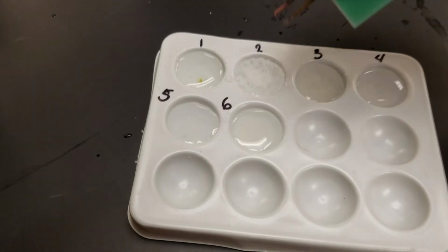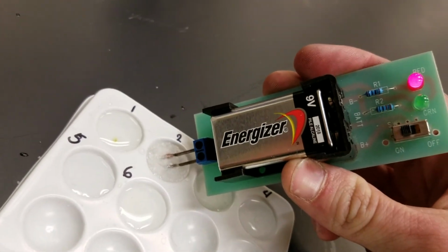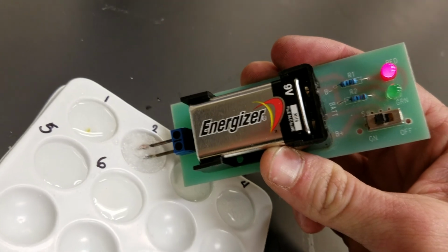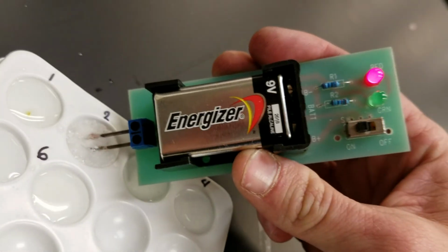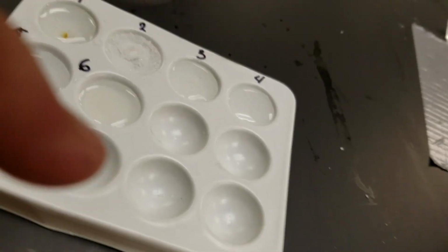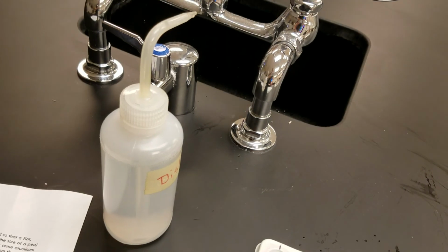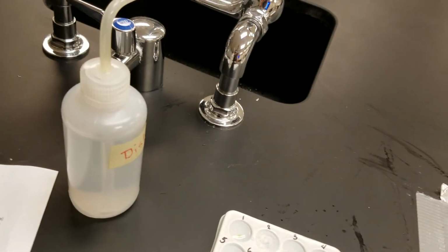Phenyl salicylate next. The red one's on and the green one is on too, but it looks very dim. So we'll say medium conductivity for phenyl salicylate. Again, I'm going to dry off my leads.